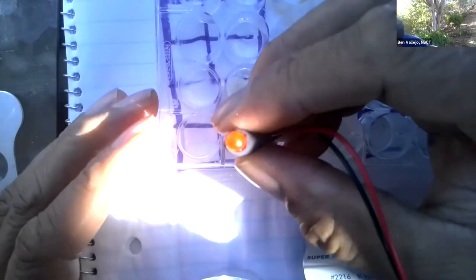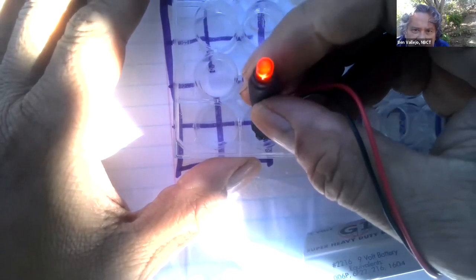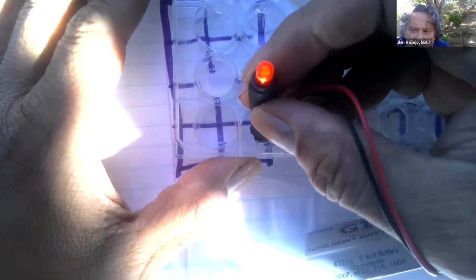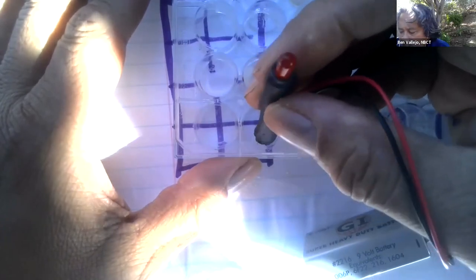Here it is. I'm kind of in the sun now. So that's what it looks like unlit. And ooh, pretty strong reaction, right? So that's your potassium iodide aqueous solution. Aqueous meaning that it's in water. All right, so everything lights up pretty well. Yay.